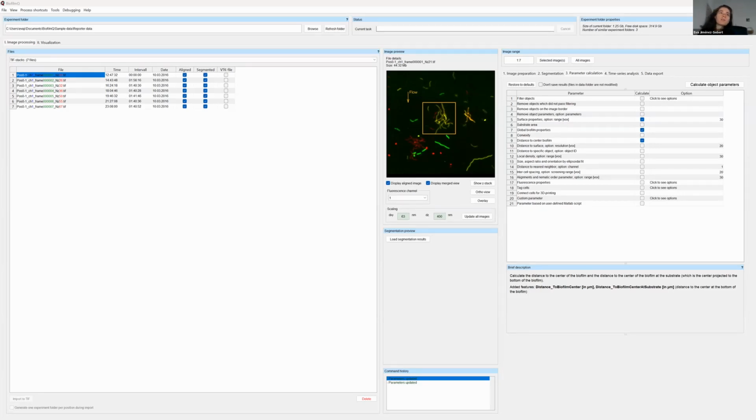Everything that I've been talking about today is classical image analysis. So it's based on deterministic algorithms, filters that you can put over your images. But some of the neural network software might be able to segment single cell, packed single cell communities better. Yeah, I think that's it.